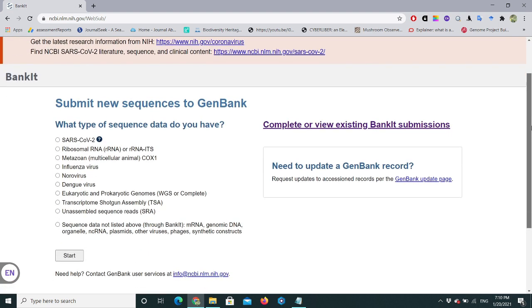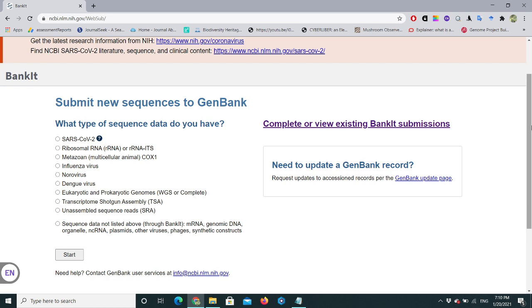This is the interface of BankIt. You can see different information here. It asks: what type of sequence data do you have? These sequences belong to a fungus and we have sequenced the ITS region — the internal transcribed region of the genome — so we will select the ribosomal RNA or rRNA ITS option and click on Start.